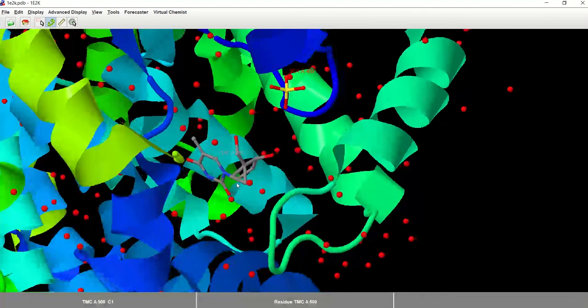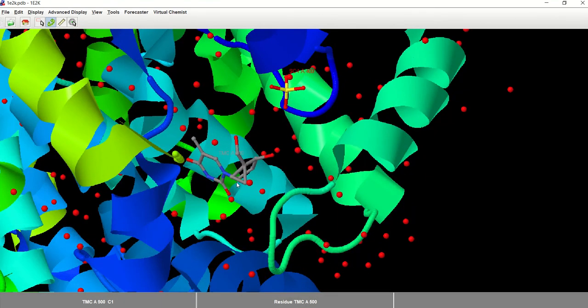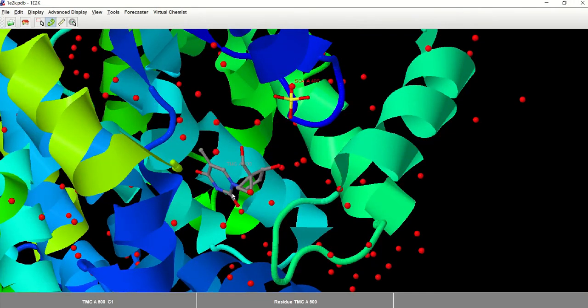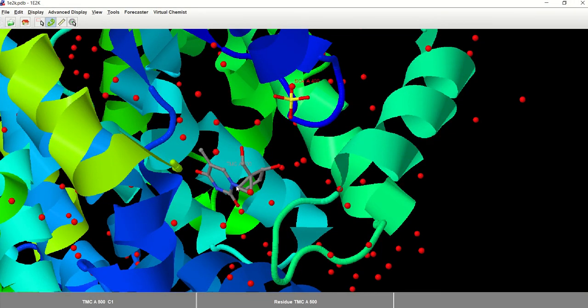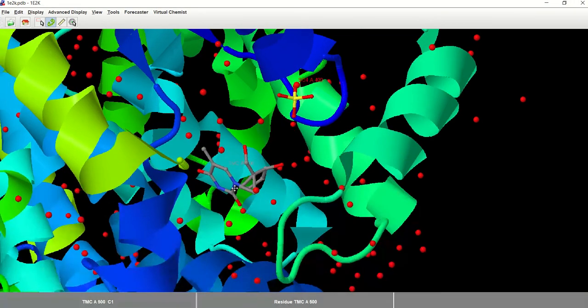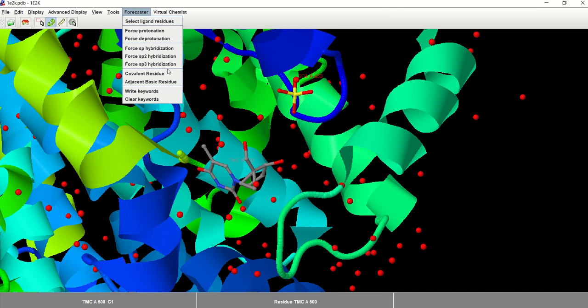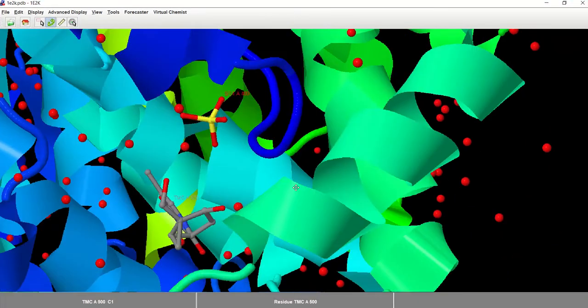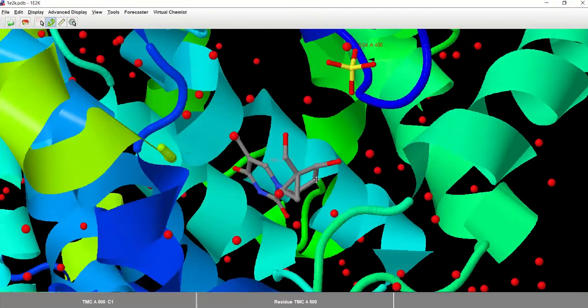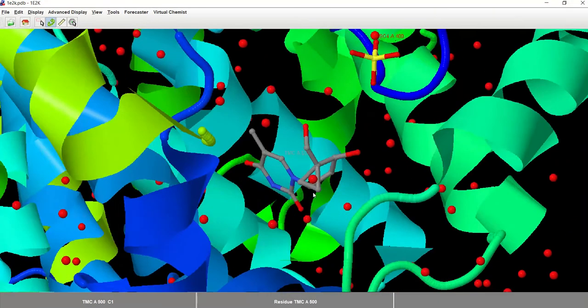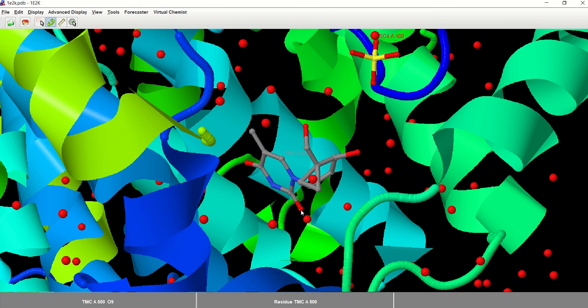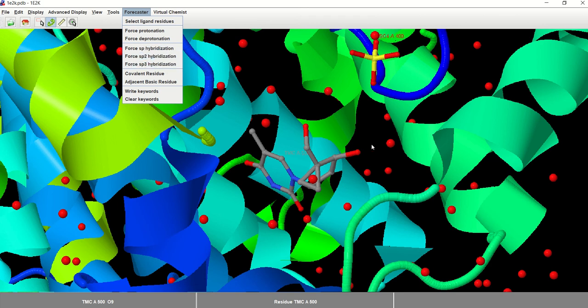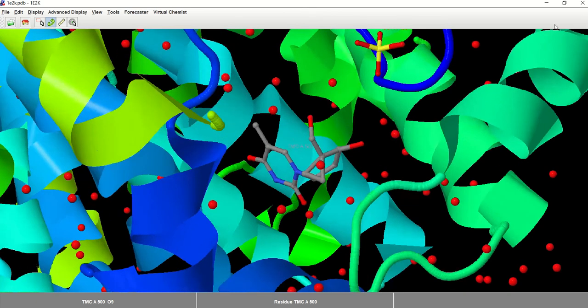And then you have to go and write the keyword to the keyword file. Now, there are some instances in which your ligand is not properly set up from the PDB. So the hybridizations might be wrong. Protonation states might be wrong. So for this, we actually have a menu where you can force different hybridizations or force protonation or deprotonation for specific atoms within your system. So for example, if I wanted to change the hybridization state of this oxygen, this is a double bonded oxygen. I would go here to forecaster and then force one of these hybridizations.